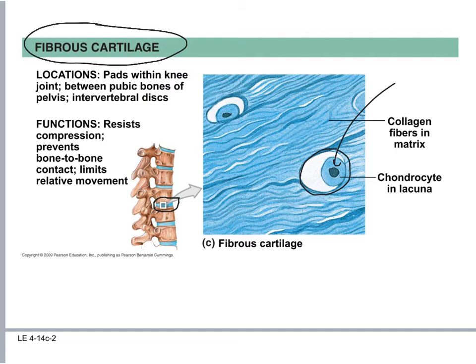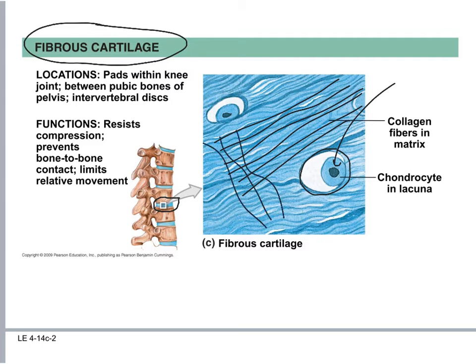What distinguishes the fibrous from the elastic cartilage is that the elastic cartilage had elastic fibers going in every direction. In this fibrous cartilage, all the fibers are going in one direction. There will be a layer of that, and then the layer just inside it, those fibers will all be going in the opposite direction. And then the layer inside that, those fibers will be going in the opposite direction again. They just keep layering, and they form this lattice work that makes the intervertebral disc pretty sturdy, so that the inside of the disc doesn't start bulging out through the fibrous cartilage.